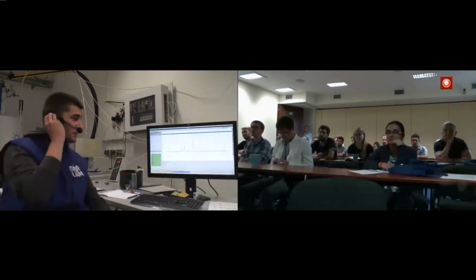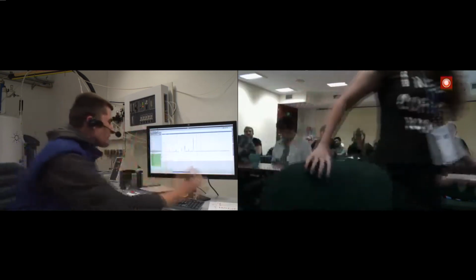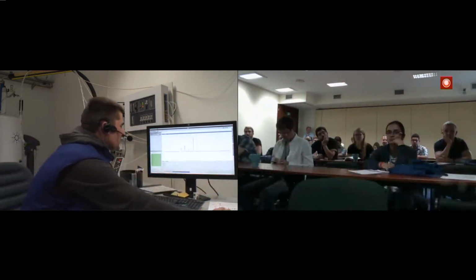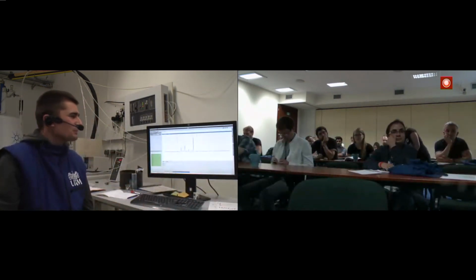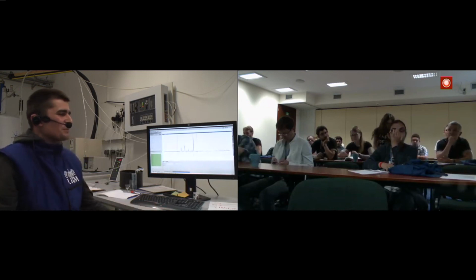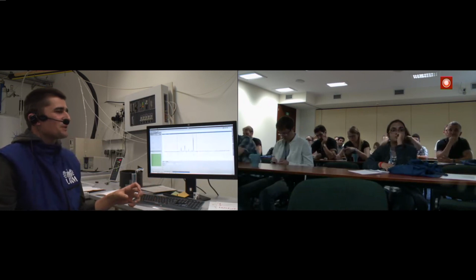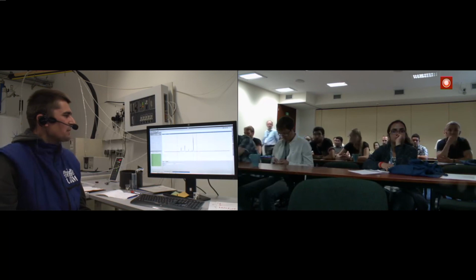That's a great question, actually, because, well, it doesn't. As you can see, first of all, the methyl group is very mobile. So from the point of view of dynamics, the electronic environment already has a very isotropic nature, which means that we do not have a chemical shift anisotropy in the case of methyl groups.